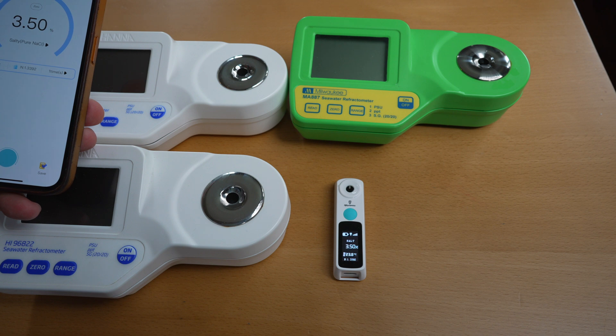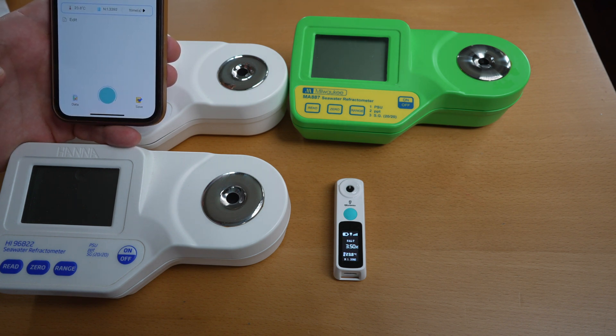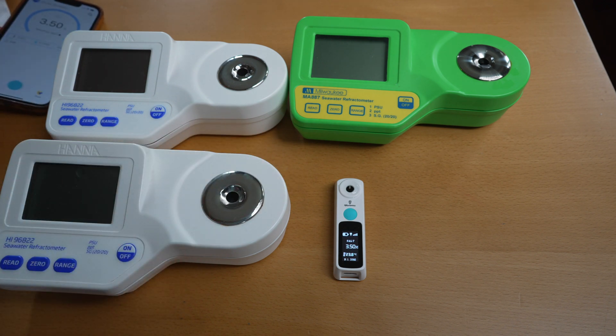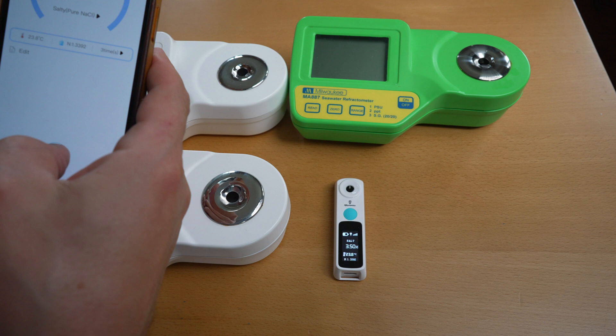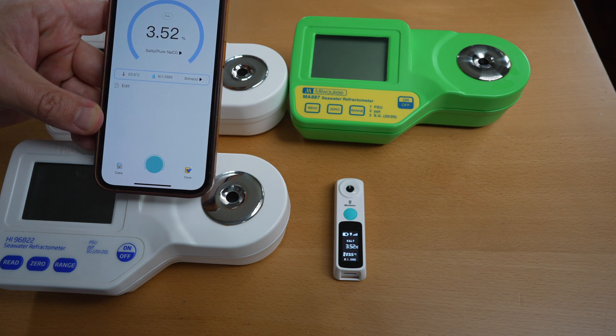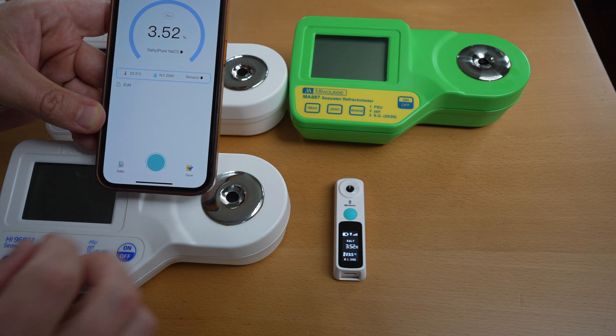The unit measures at 3.5%, which is exactly 35 parts per thousand matching the two HANA units. So in my opinion this is very, very close. You still have to do conversion, but I don't see why this company cannot update the firmware to give readings in parts per thousand or even specific gravity. Now if you try doing it more than once — let's try three times — it measures three times and gives you probably the average, which is a neat feature that checks for inconsistency with a single measurement.